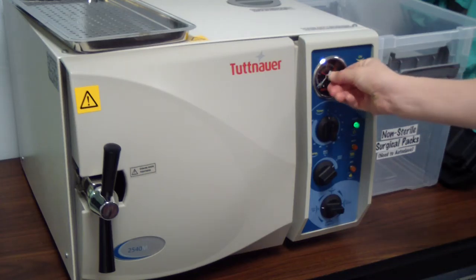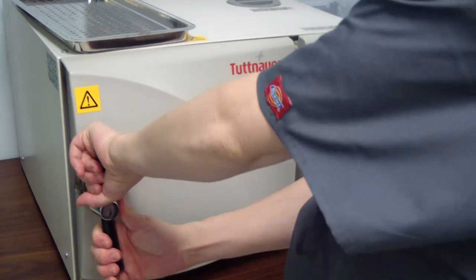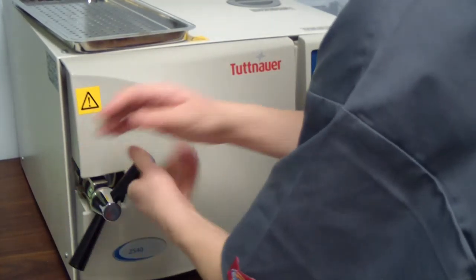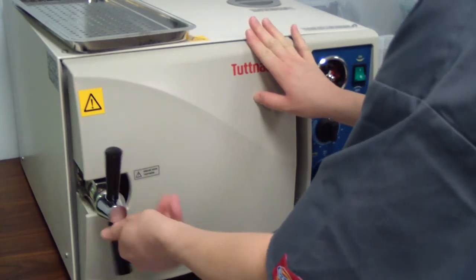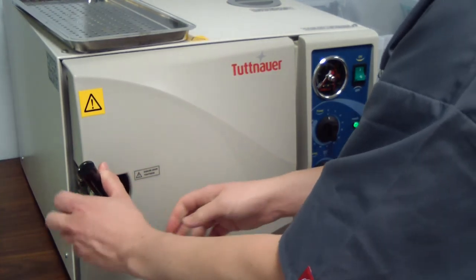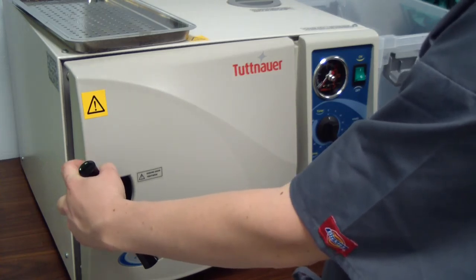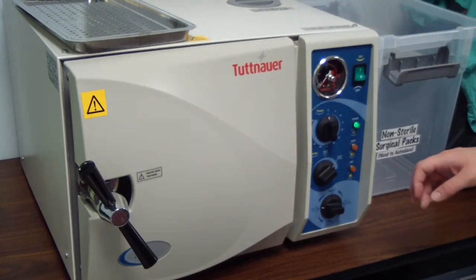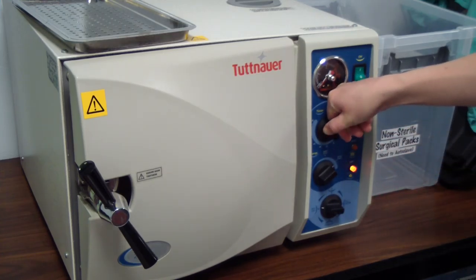Once that gets to zero, turn the red line down to zero and then you can open the autoclave. It won't let you open it if the pressure has gone down to zero. You're going to open this all the way so you can't anymore and then just pull the door until it stops, so you have about an inch for it to vent. Then set the timer for another 30 minutes.